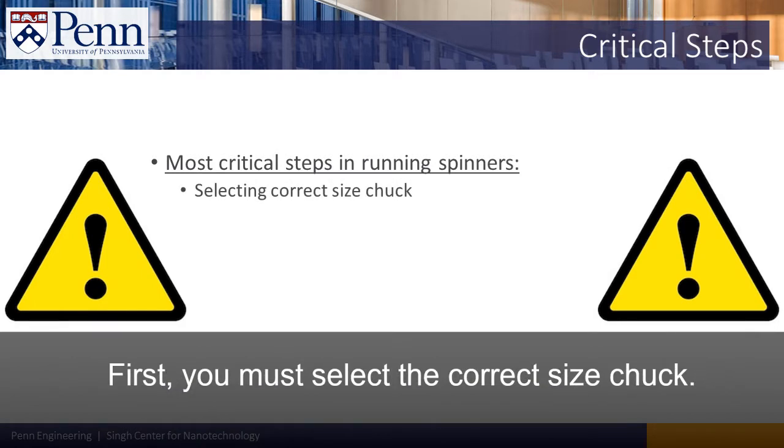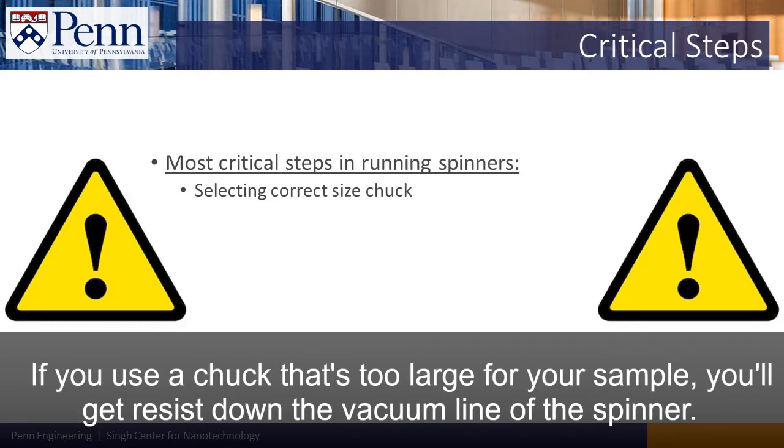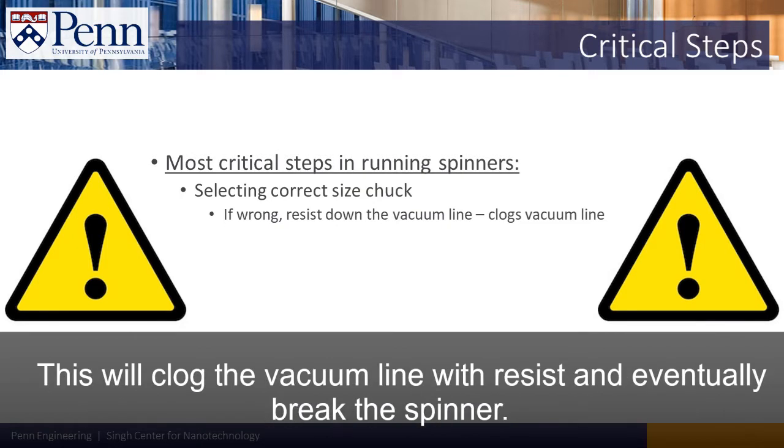First, you must select the correct size chuck. If you use a chuck that's too large for your sample, you'll get resist down the vacuum line of the spinner. This will clog the vacuum line with resist and eventually break the spinner.